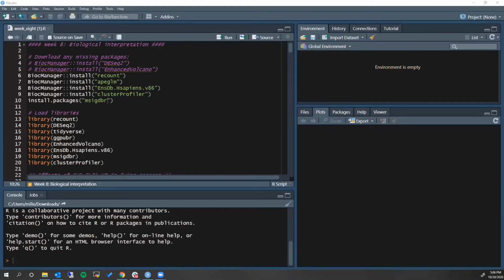All right, so now that we're about 5 minutes in, let's go ahead and get started. Did anybody run into any issues installing any of this?